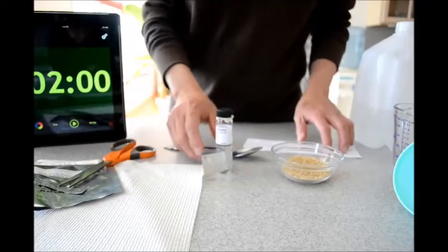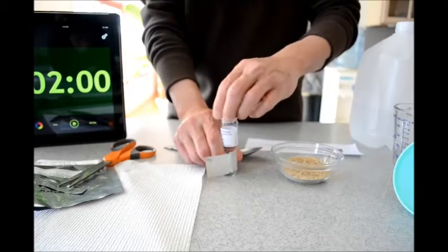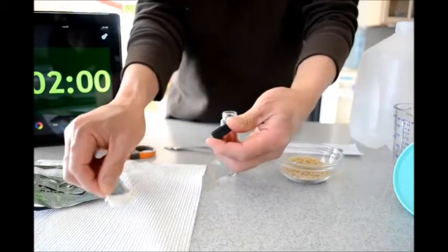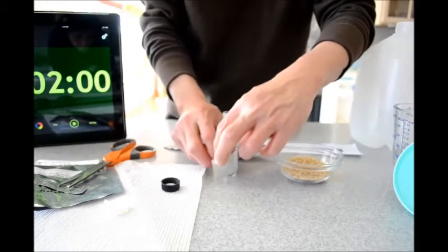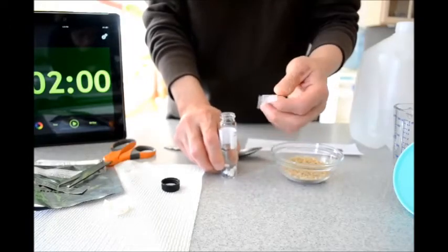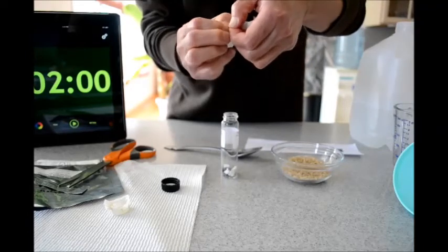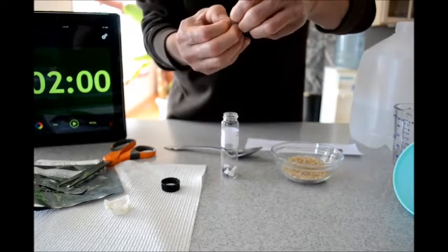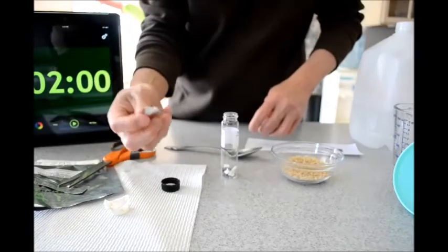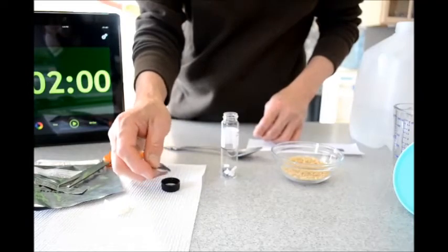Let's begin by preparing the detector for use. I'm going to unscrew the top off, take the filter paper that's there and set it aside. Take the solution pack it out — there is a nut here I can just open. Be careful not to spill any drops, and I will put one drop into the cap.